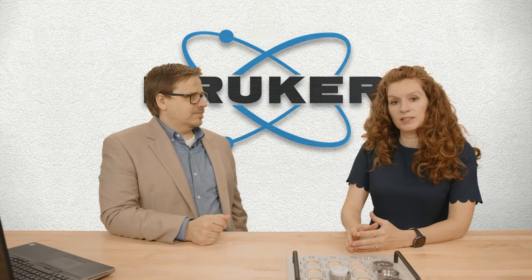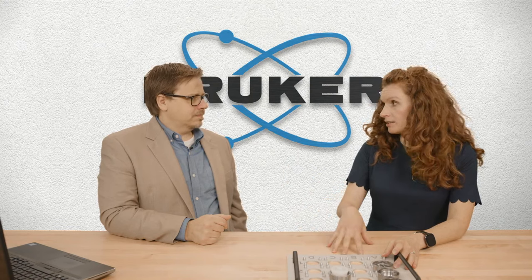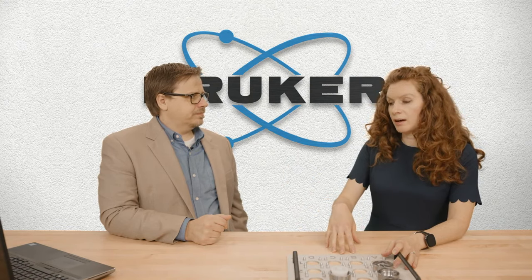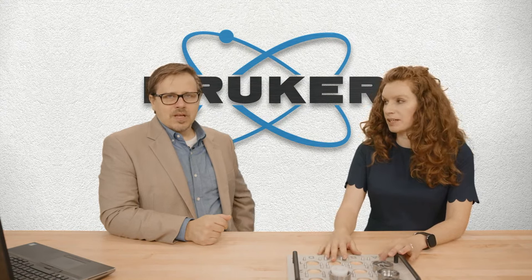We cannot determine if it's graphite or a compound with the iron. Yeah. We can just say, is it carbon or not? So if you wanted to see more about that, you might want to do XRM, if it's small enough, or XRD for the structure. That's what I can tell you.